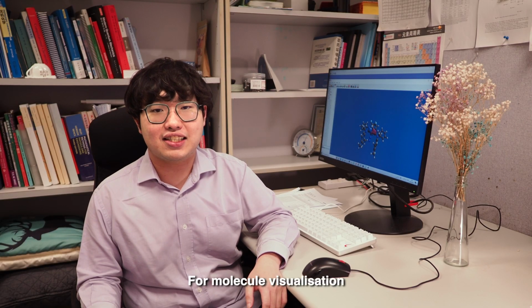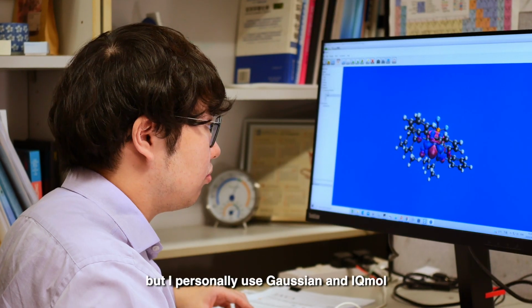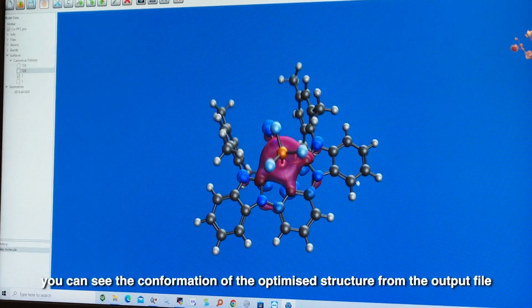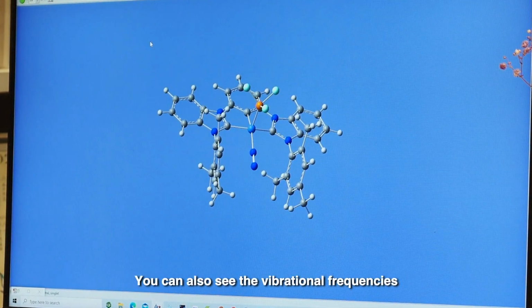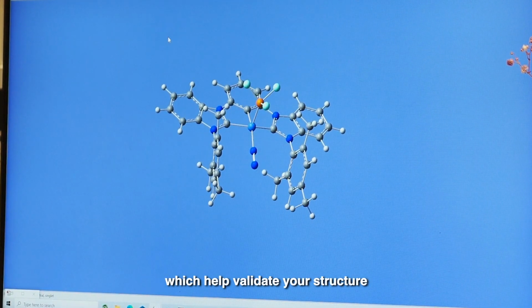For molecule visualization, there are multiple softwares that serve the same function, but I personally use Gaussian and IQMol. In these softwares, you can see the conformation of the optimized structure from the output file. You can also see the vibrational frequencies and how they vibrate at a particular frequency, which helps validate your structure.